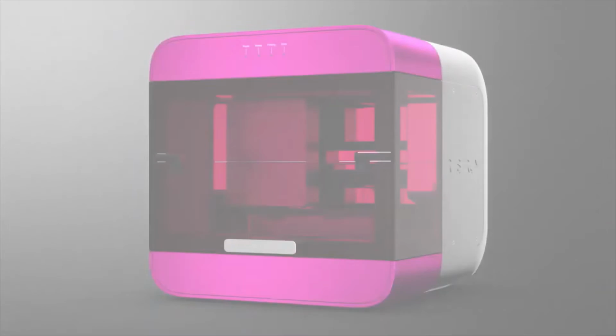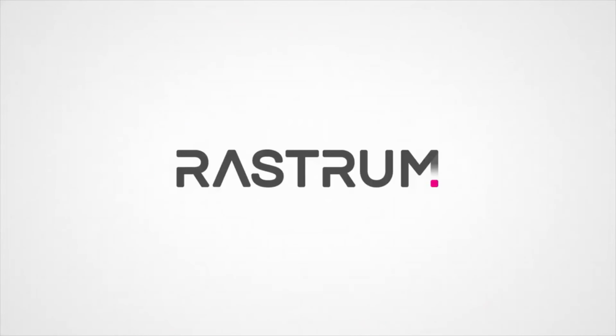Make complex 3D models simple. With RASTRUM, the revolutionary cell biology platform from Inventia Life Science.